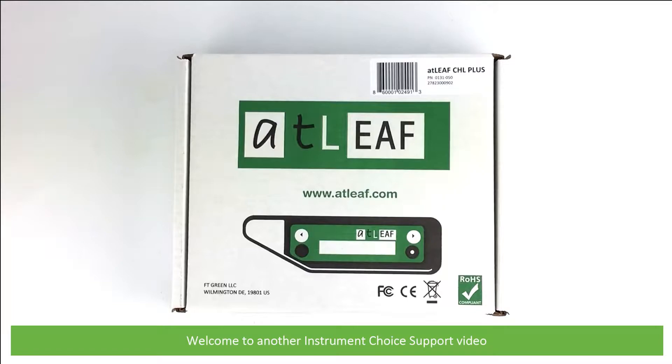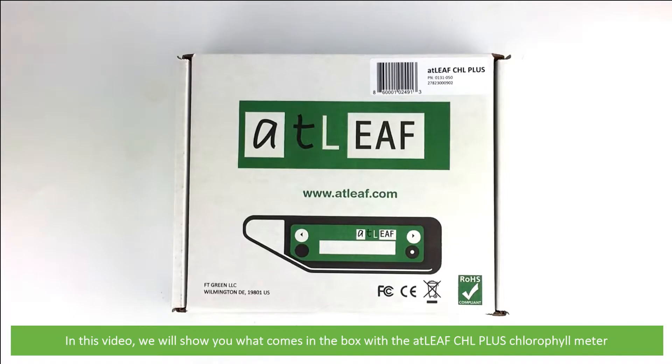Hi and welcome to another Instrument Choice support video. In this video we'll show you what comes in the box with the ATLEAF CHL Plus chlorophyll meter.